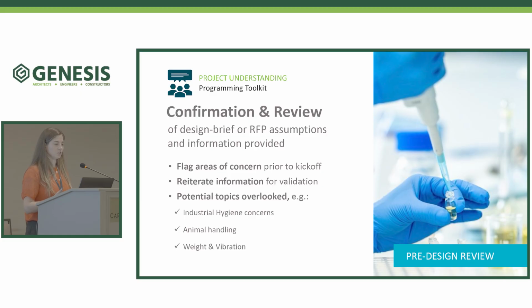But in talking to users at the kickoff, they expressed they were following some BSL-2 protocols with their work that included tissue handling and tissue storage. So flagging that right away for reconfirmation and bringing environmental health and safety into the conversation to align on that was a very important thing to do, so that we're not building the design on a faulty foundation.